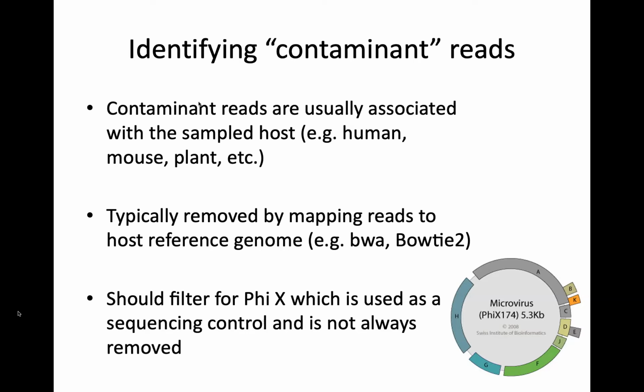Okay, so that's on the mapping side. And if you're thinking about parameters for Bowtie or something, you want to be fairly lenient with that mapping, right? You might as well trim off a few extra reads that you're not sure about that might map to the human genome and discard them, as opposed to keeping them later, right? Because you don't want reads where, maybe it mapped to the human genome, but we'll put it through Kraken or MetaPhlAn and see what it spits out. We want to try to minimize that as much as possible.